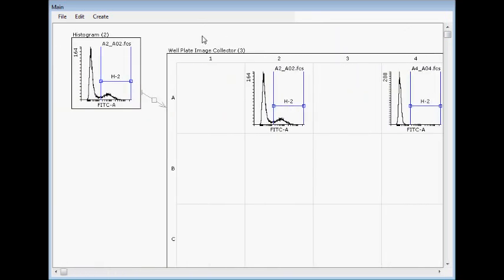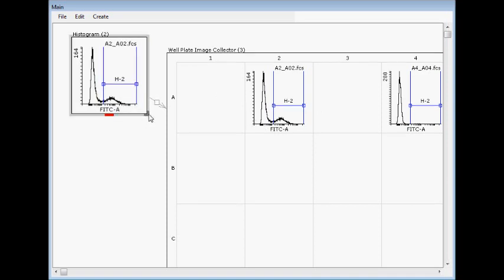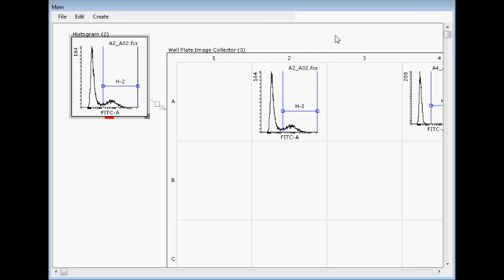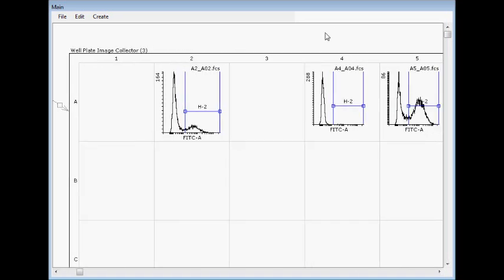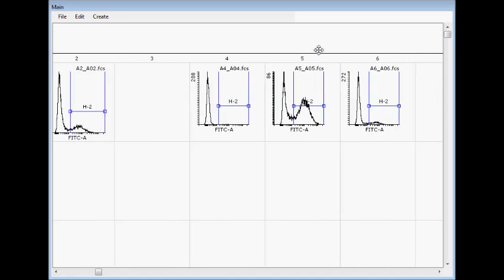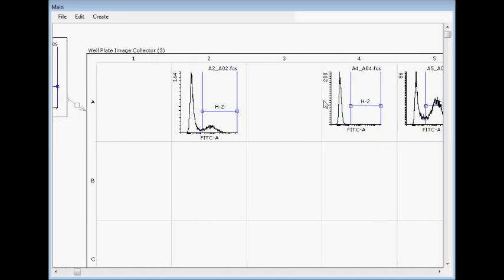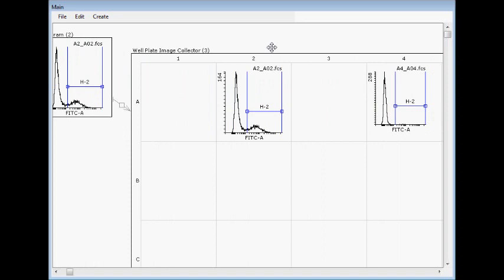And the size of these are defined by the biggest image we have here. For example, if I now resize this, now you can see all these wells or cells are resized according to this. We have here collected the smaller images before resizing of that image, but they are now resized like this.